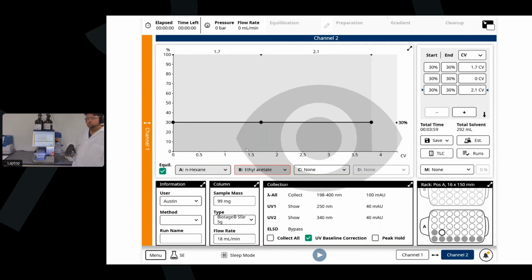If you did have to switch over the solvents on top to reverse phase, simply take your lines out of the solvent bottles and prime them, which is going to dry out the lines. If I am switching from a normal phase solvent to a reverse phase solvent, I may do a methanol wash in between just to get rid of any residual nonpolar solvents. So prime those lines, maybe do a single wash with a polar organic, and then put it into my next solvent and prime that as well.